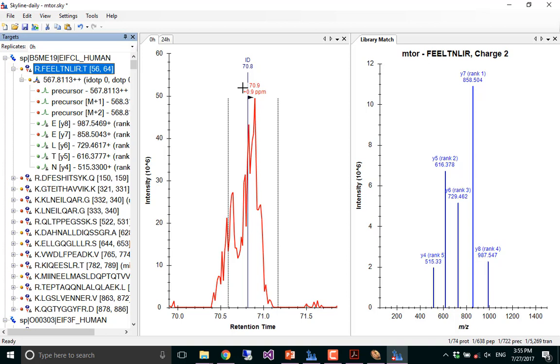So you said this is a facsimile. Yes. Is this like the final thing, or is it still like a work in progress in terms of what's potential? This, I think, is very likely to stay where it is right now, mainly because it is a representation of what is in the Pecan manuscript, which is something that we've just gotten accepted, and we're using this as the sort of final version of the program, right? So it probably won't change that much in the long term. And if it does, we'll probably do updates as we go. Right now, it's a different tool that you can use to interact with Skyline, but it's not going to be inside of Skyline.